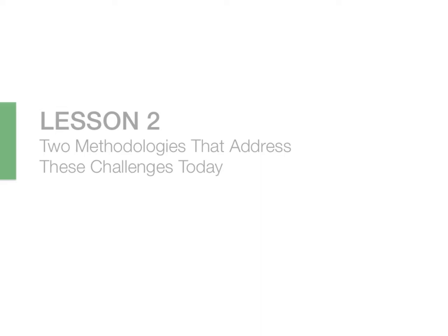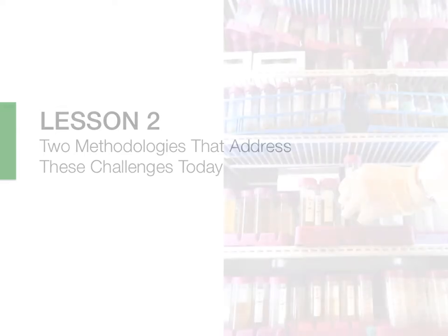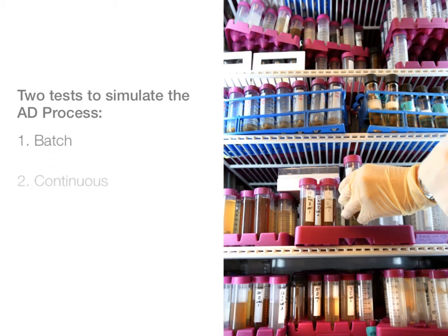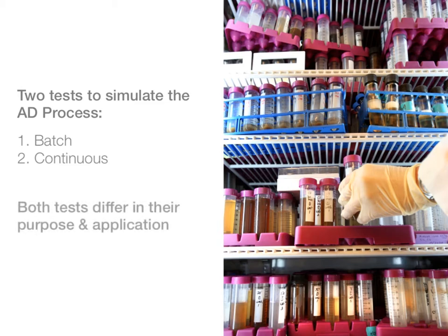Lesson 2. Two methodologies that address these challenges today. We have at our disposal two popular ways to meet the challenges we came across in Lesson 1, batch and continuous fermentation tests. While both tests differ in their purpose and application, they both simulate the anaerobic digestion process on a smaller scale.